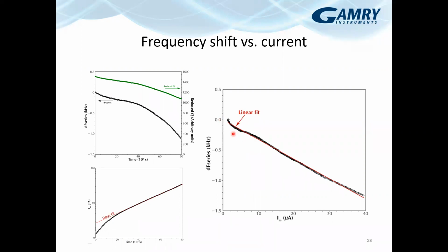Because now you have cells growing and dividing in the biofilm, and you're saying that, wow, the current that I'm measuring, which I think is a proxy for the biofilm growth, is telling me that for a given amount of current, I get an equivalent amount of frequency shift. And if frequency shift can be turned into a mass, it's telling me that for every packet of mass, or for every cell that gets added to the biofilm, that results in a net increase in current.